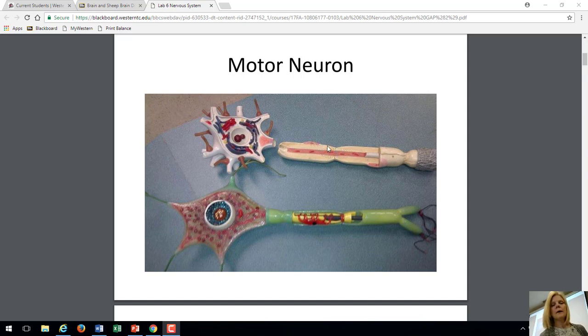And then there's these spots, there's bare spots on the neurons. So this little indentation right here is where there's no myelin, and we find voltage-gated sodium and potassium channels there, because that's where the impulse is going to jump, from node to node to node. And that node is called a node of Ranvier. We talked about that in lecture also. But that's the node of Ranvier.